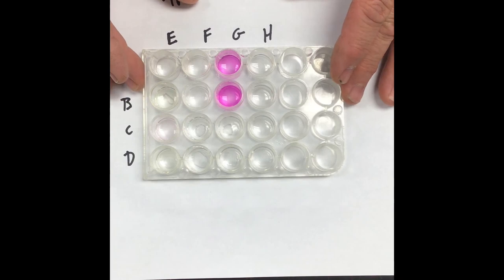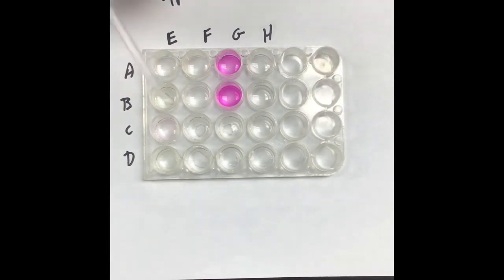We'll go ahead and look at D. I'm going to add 10 drops of D going across. 10. Okay, so that was 10 for each of those.